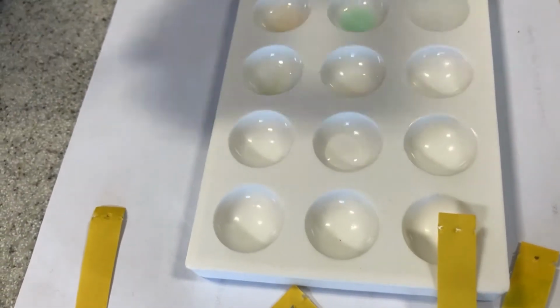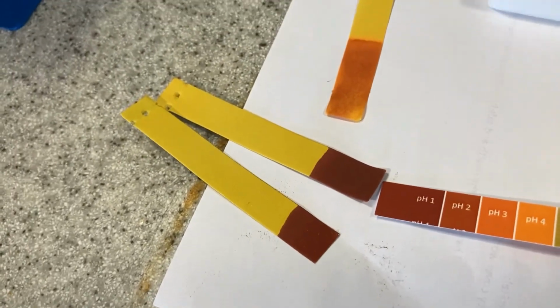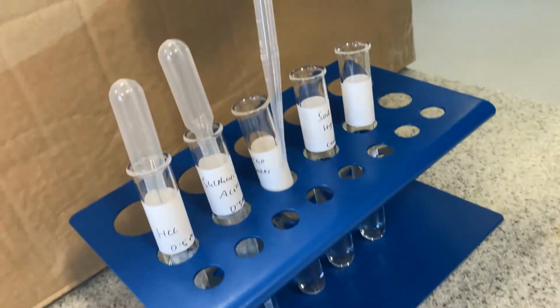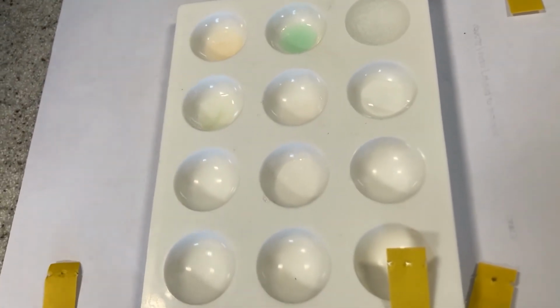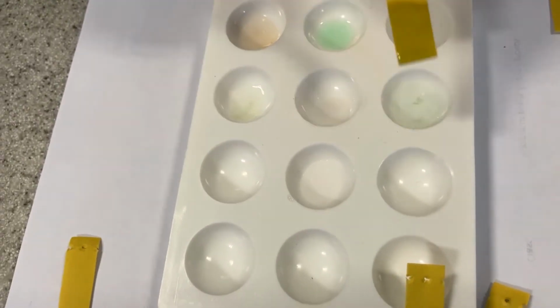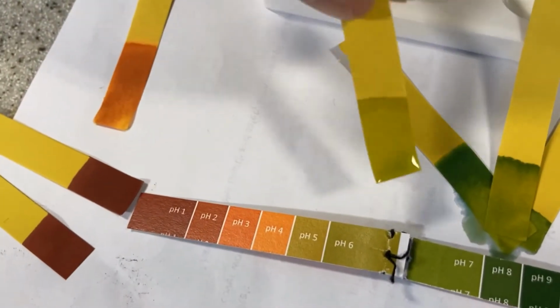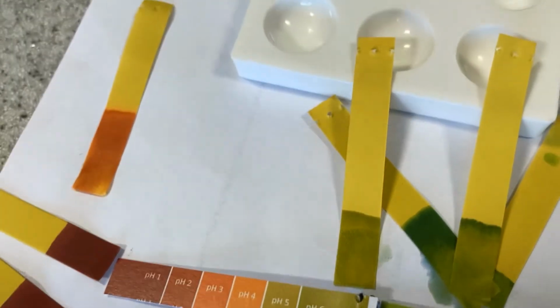Oh, it's an acid, no doubt. And water. Water with acid, alkali, neutral. What could it be? We're somewhere in the middle. This is somewhat neutral, I would say.